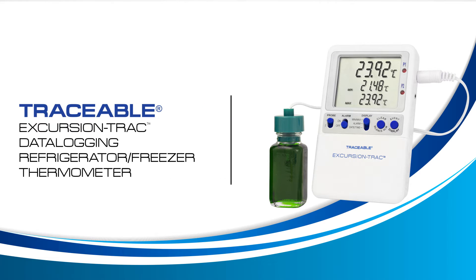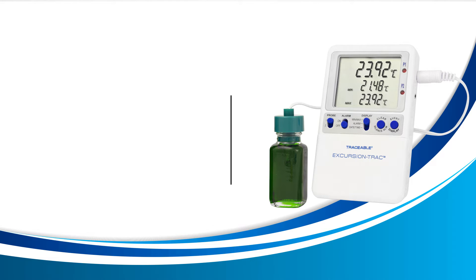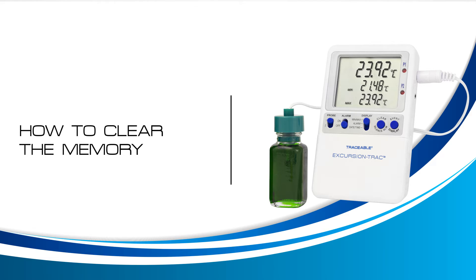Welcome to a Traceable Products instructional video for the Traceable Excursion Track Thermometer. In this video we will learn how to clear the memory. Clearing the memory on your device will erase all of your valuable temperature observations. Ensure you have downloaded the data you need before proceeding. See the downloading stored data video for more information.